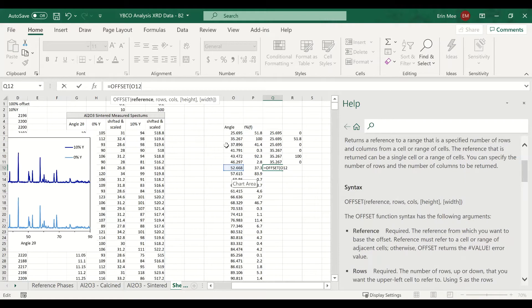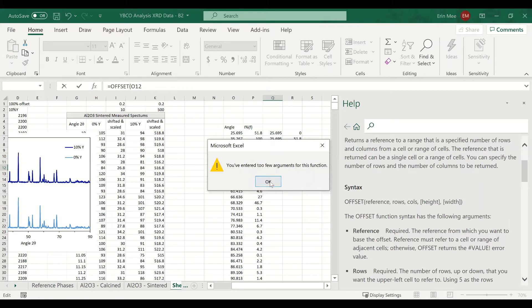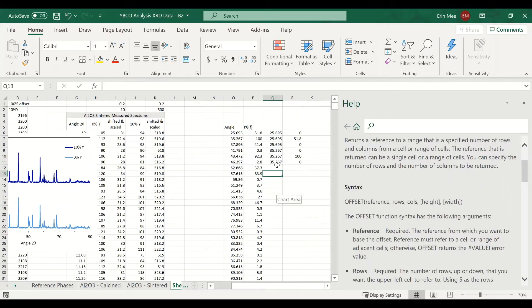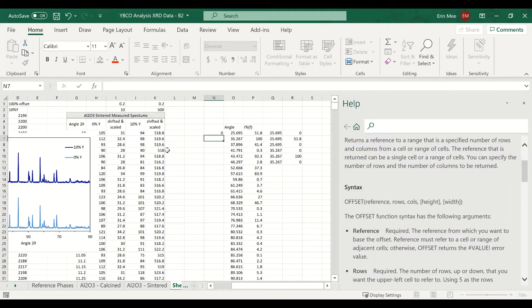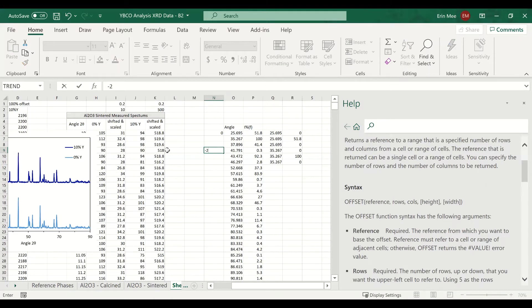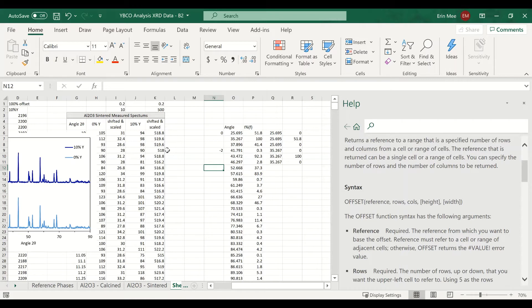For this cell we need to go up one, two, three, four rows. If we use a nearby cell as reference, we need to go up one, two rows, and for the last one it would be zero. So in a helper column I'm going to start an index: zero, then go down three cells, then negative two, go down three cells, then negative four — so we can copy this down and it repeats for all remaining cells.